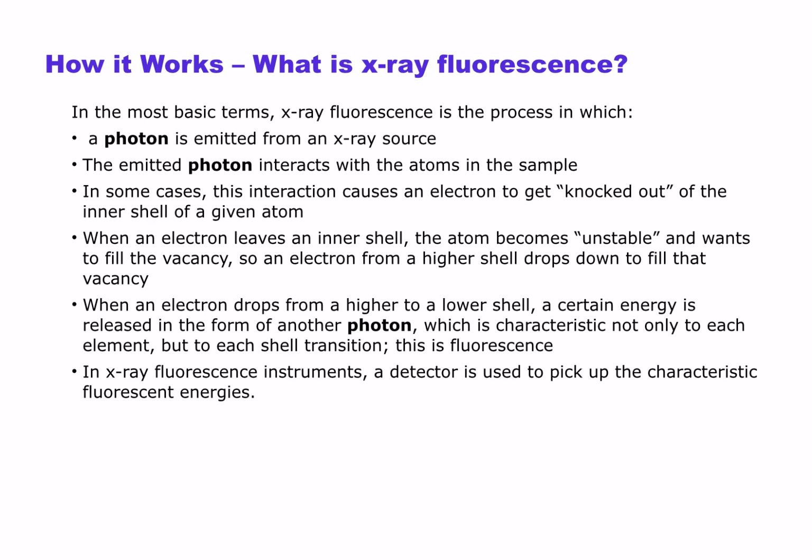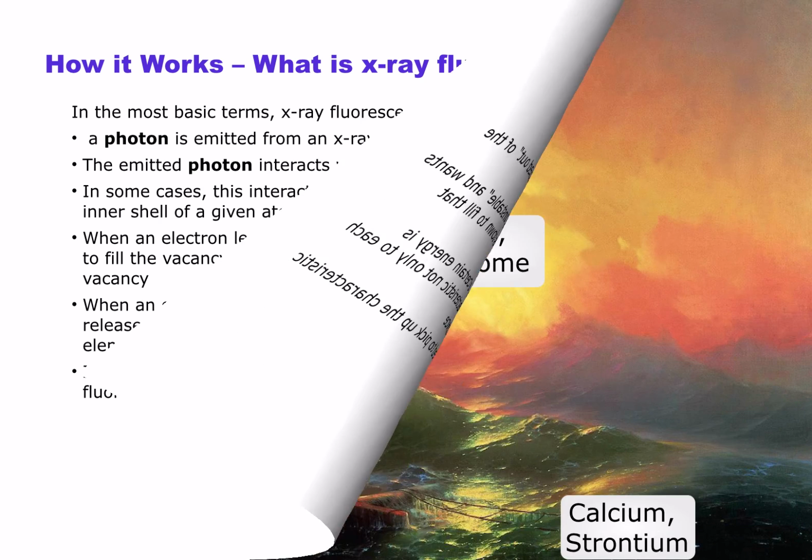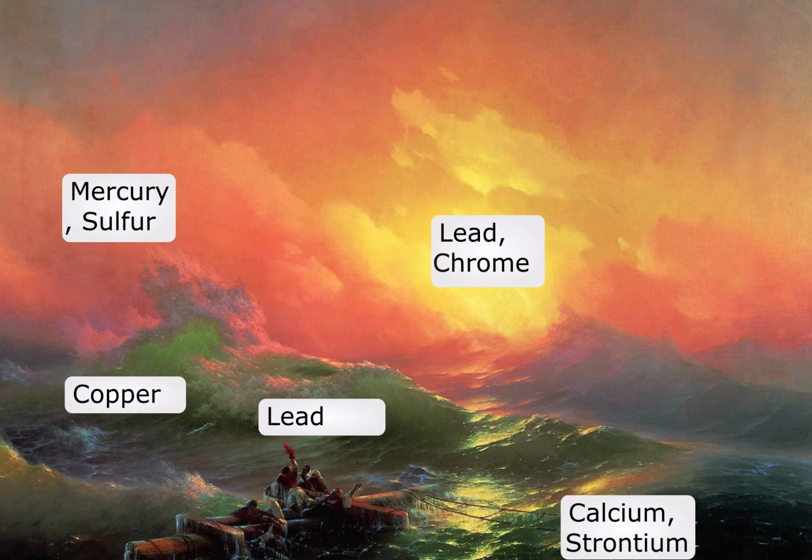And then finally, just like your eyes, we have a detector to pick up these characteristic fluorescent energies. So the process of X-ray fluorescence is very close to the process of color fluorescence, with which you are familiar in your day-to-day life.